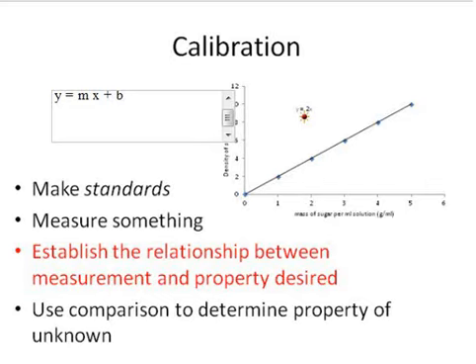So again, you construct the graph. You put the points on the graph. You use the linear regression program, which is called adding a trend line, adding a linear trend line. So the words that are sort of used interchangeably are the best fit line, the linear regression, or adding a linear trend line. Those sort of all mean the same thing. And the procedure within Excel will create this line that goes through the points, and it will also create this equation for you that you can use to find out what the unknown is.